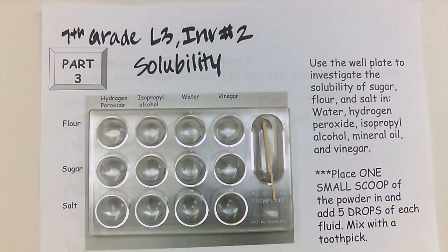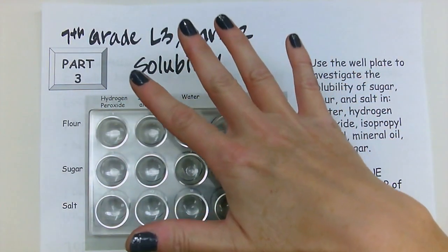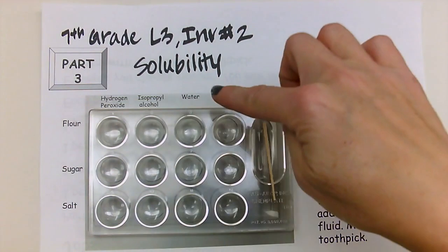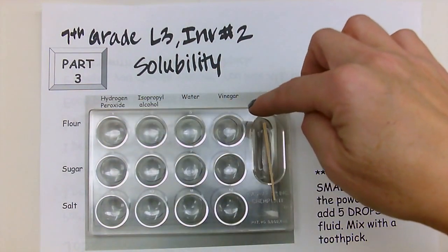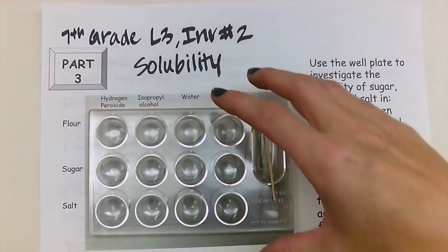Okay, welcome to 7th grade lesson 3 investigation 2. This is solubility. We are going to look at the solubility of solid substances in different fluids. So today we're going to look at actually 5 different substances. This is 4 that you guys are going to do, but I will demonstrate the mineral oil.